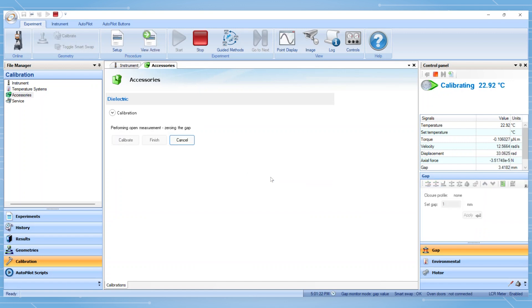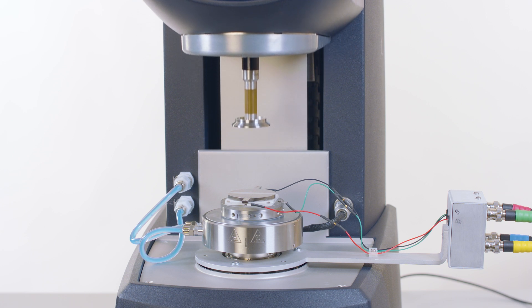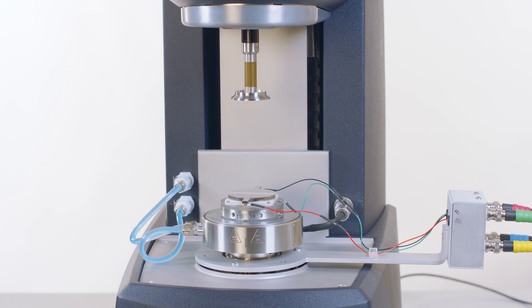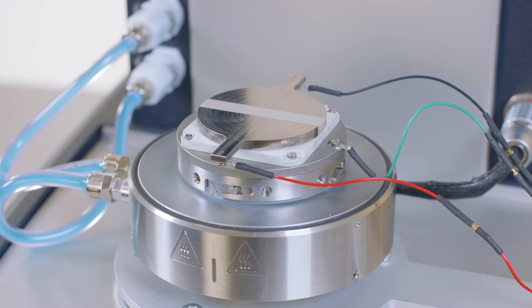The first step zeros the gap, then raises the head to 100 millimeters to perform the open calibration.